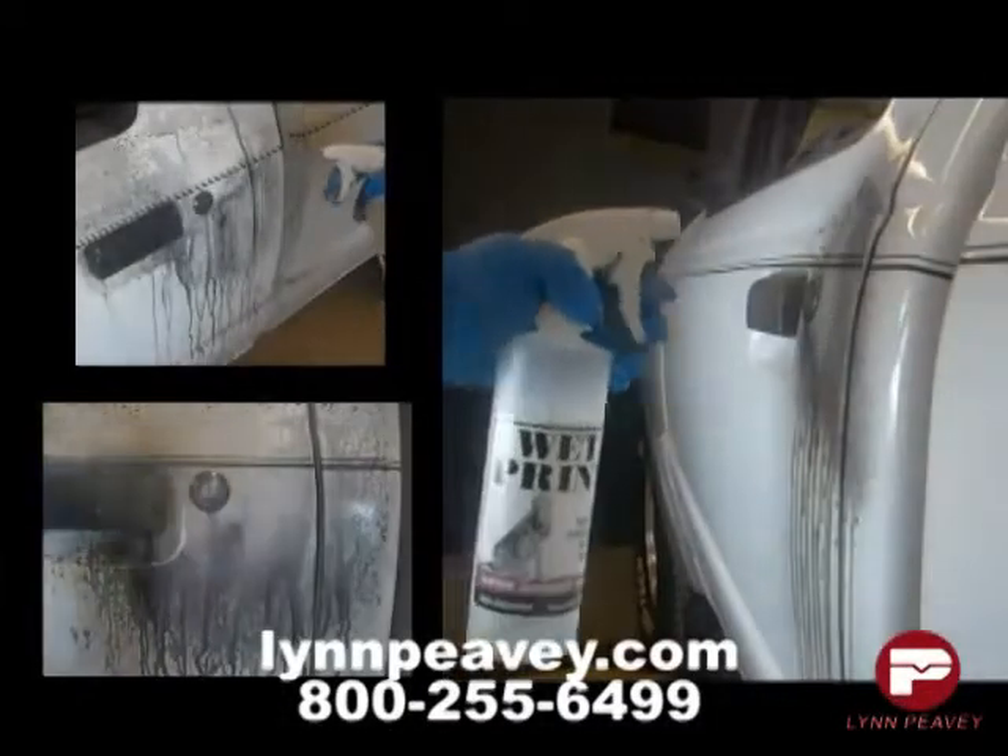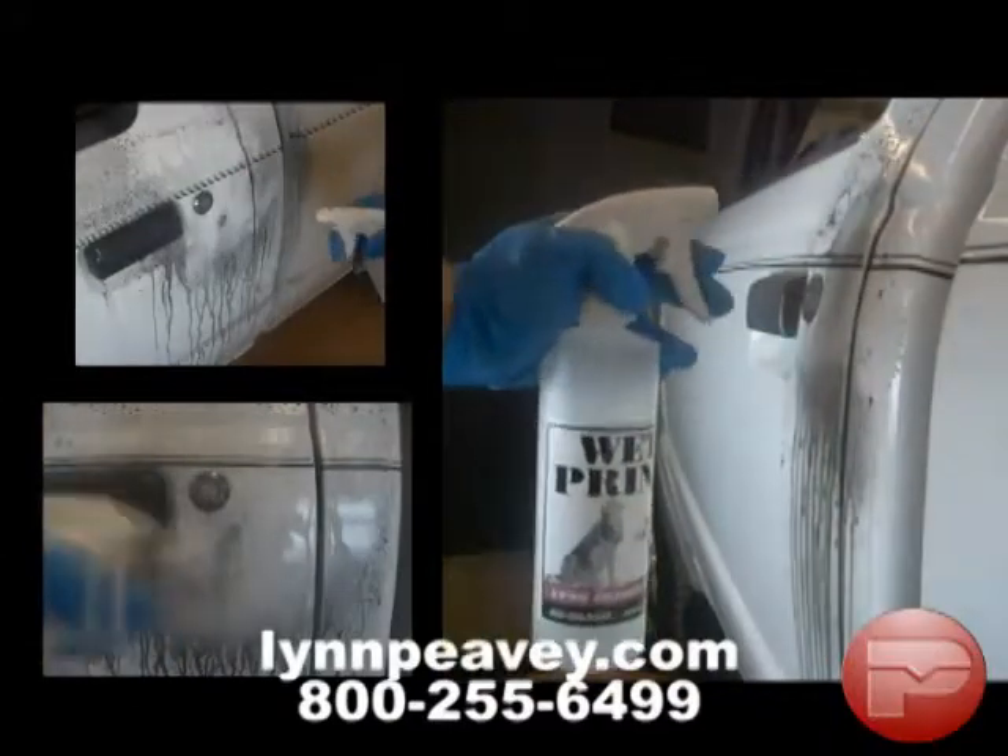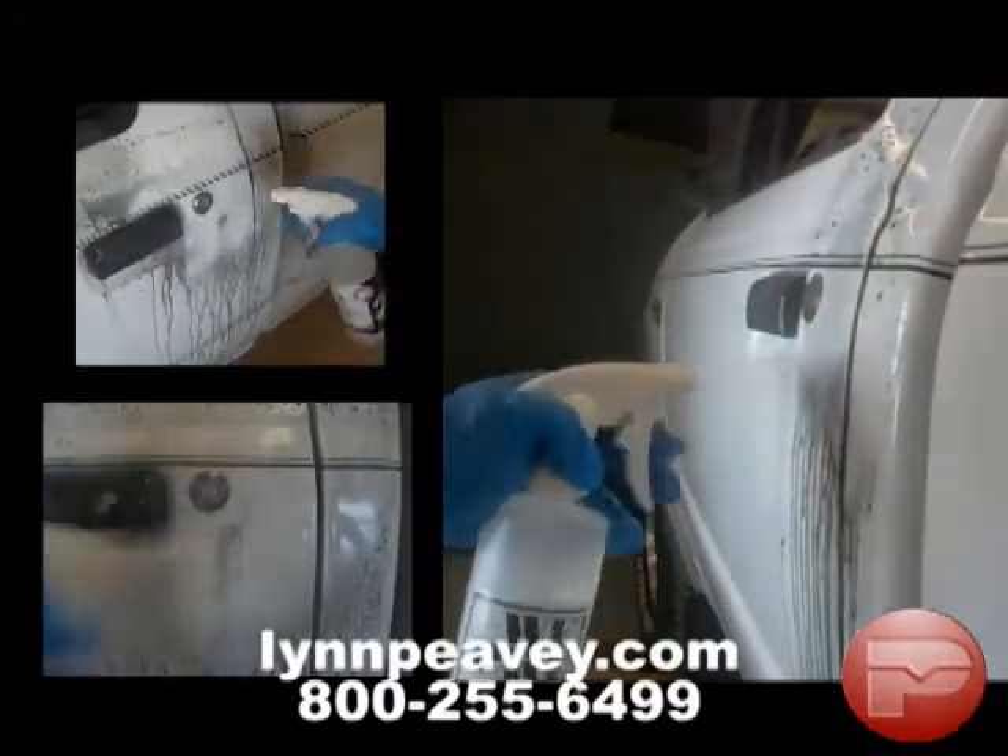Once the surface has been covered with Wet Print residue, next it is cleared of excess solution by spraying the entire area down with water.